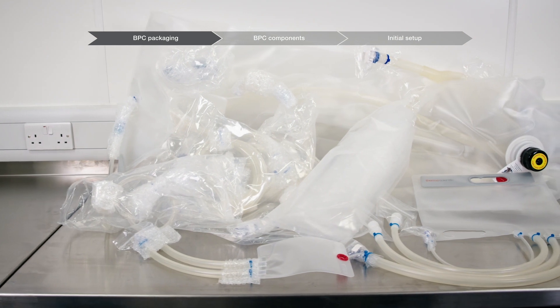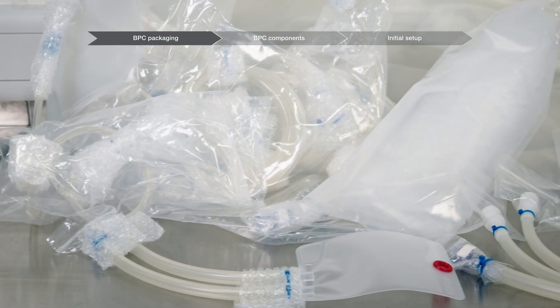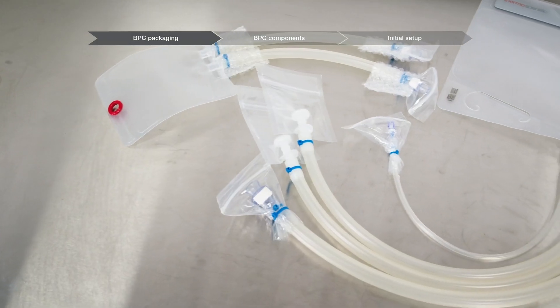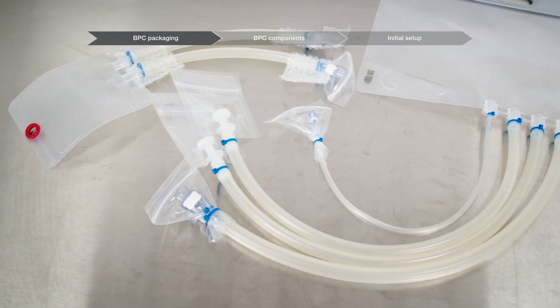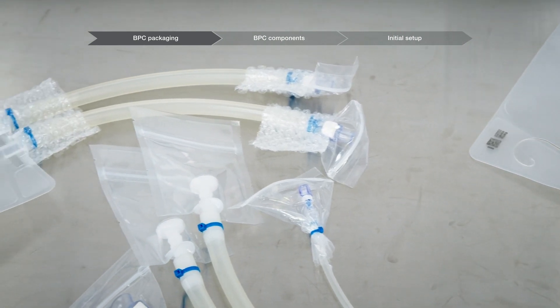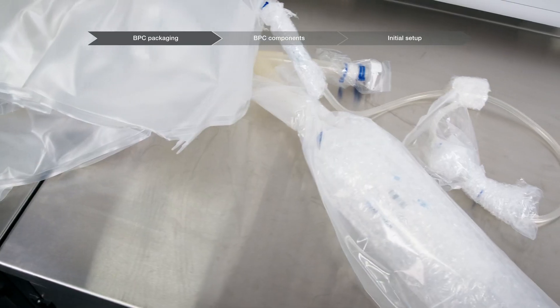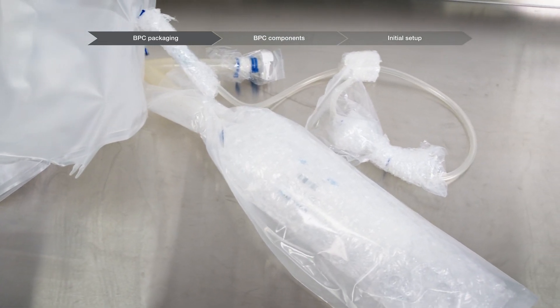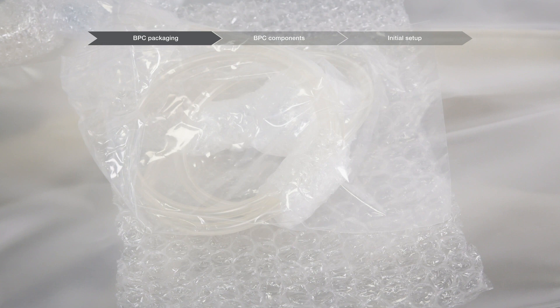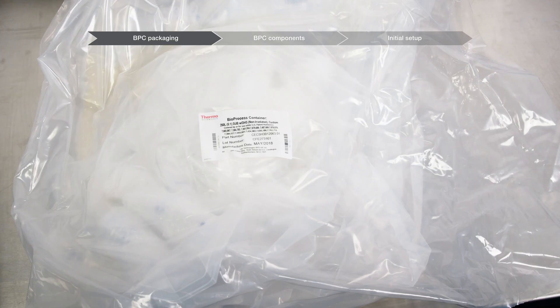BPC inner packaging varies by product type and size and may vary on custom products. These may include protective plastic bags or poly bags that cover the ends of each of the line sets on a BPC or tubing assemblies and also over coils of tubing. Bubble wrap surrounding the filters, connectors, clamps, and cable ties. A layer of bubble wrap placed between the coils of tubing and the chamber, and at least two outer poly bags that cover the entire BPC assembly.